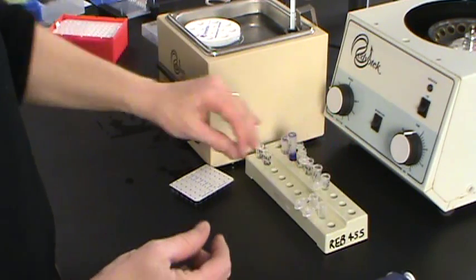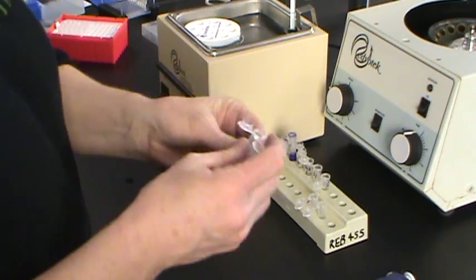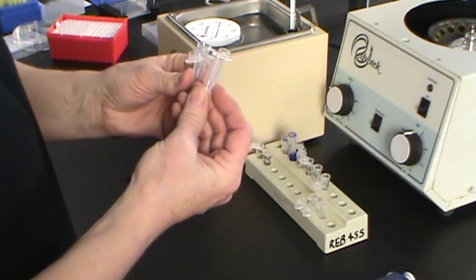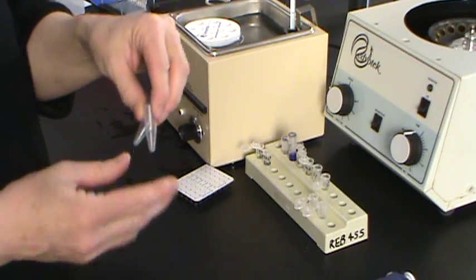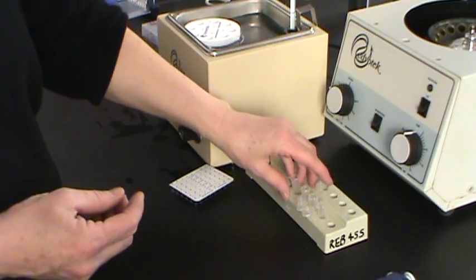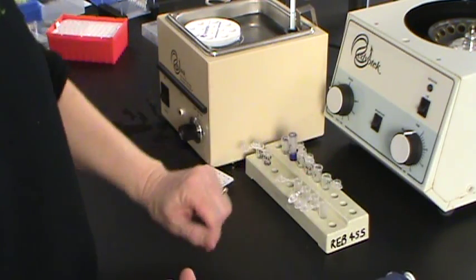You will need to have 4 reaction vessels, 4 different microfuge tubes. And as I suggested, it would be good to label them so that you can keep track of them. A good way to label them is suspect 1, reaction 1, that's why I suggested S1, R1, suspect 2, reaction 1, S2, R1, and the same thing for the other sample.